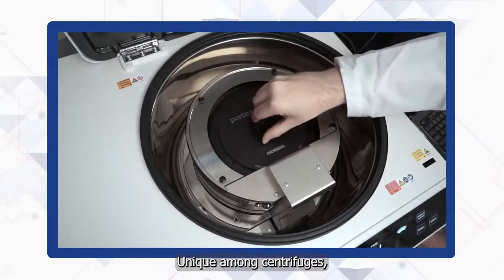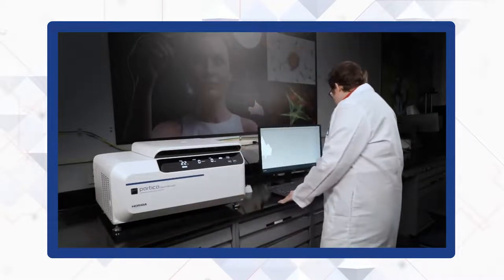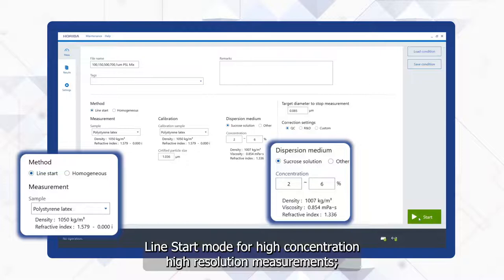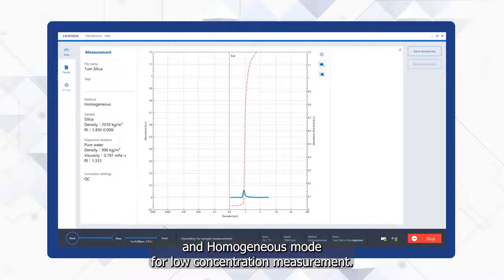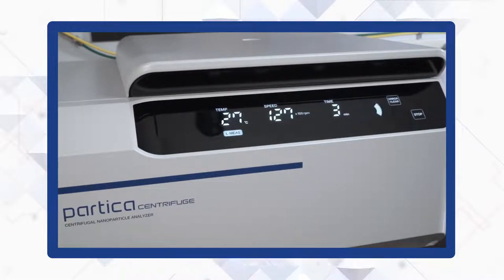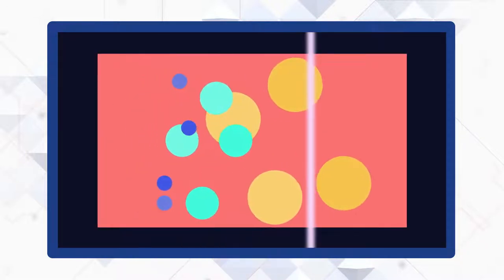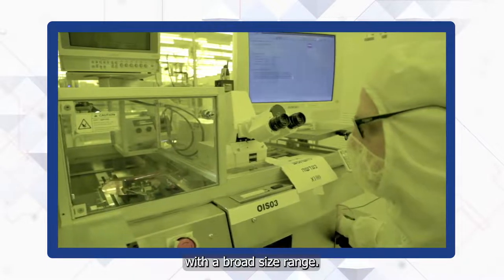Unique among centrifuges, the Partica Centrifuge features two different measurement modes: Line Start Mode, for high-concentration, high-resolution measurements, and Homogeneous Mode for low-concentration measurements. Speed Ramping begins measurement at a slow speed and gradually accelerates, measuring large particles before small particles — ideal for wafer analysis or other samples with a broad size range.